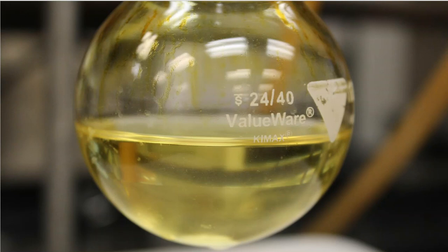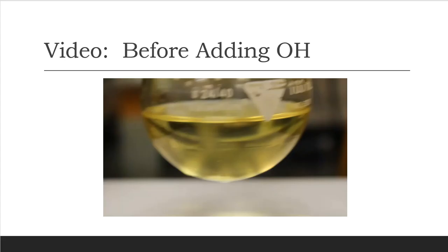All right, so again, make your observations. This is before I add the sodium hydroxide, and it's before I add the hydrogen peroxide. So this is what this has turned into. So once more, pause it if you have to, write down your observations, and then we'll continue on in the next slide.